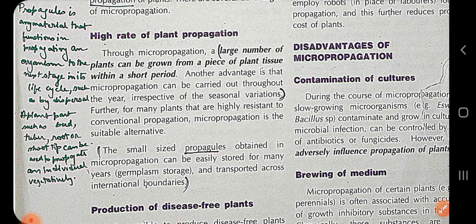Through micropropagation, a large number of plants can be grown from a plant tissue within a short period of time and space, irrespective of seasonal variation. So whatever the season may be, you can grow plants in large quantity. Good commercialization, a good business approach, which will make you a lot of money.